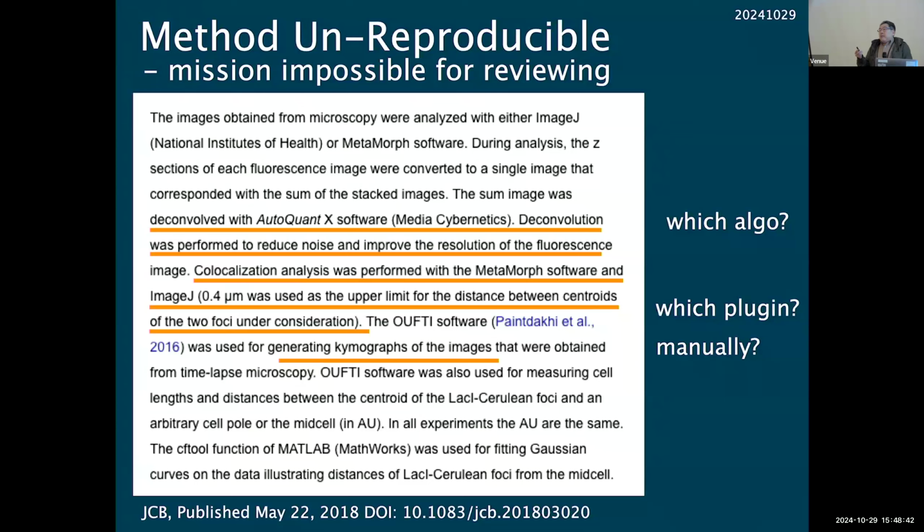But there's a co-localization master there, Fabrice. I think he would complain a lot about this sentence. And then kymographs. So where's the ROI? Region of interest, we don't know. So this kind of description looks detailed, but it's not enough.